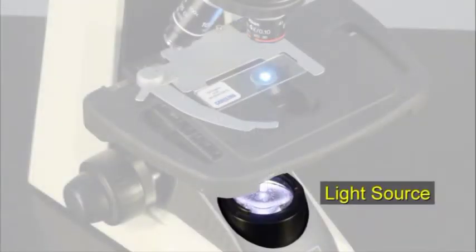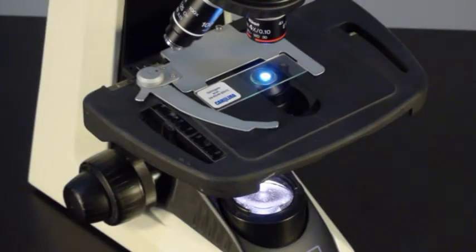The light source mounted below the mechanical stage directs light from the lamp up through the iris diaphragm, condenser, and slide into the objective lens. Three adjustments control slide illumination.